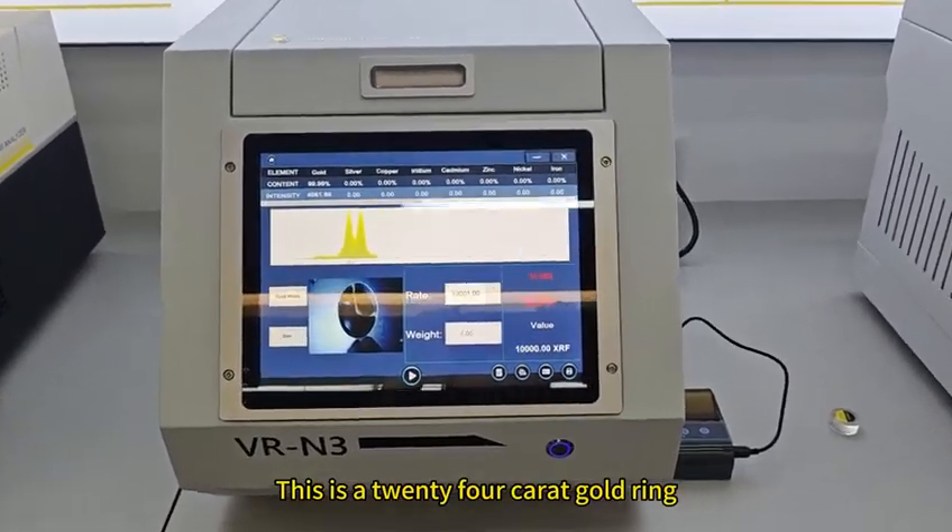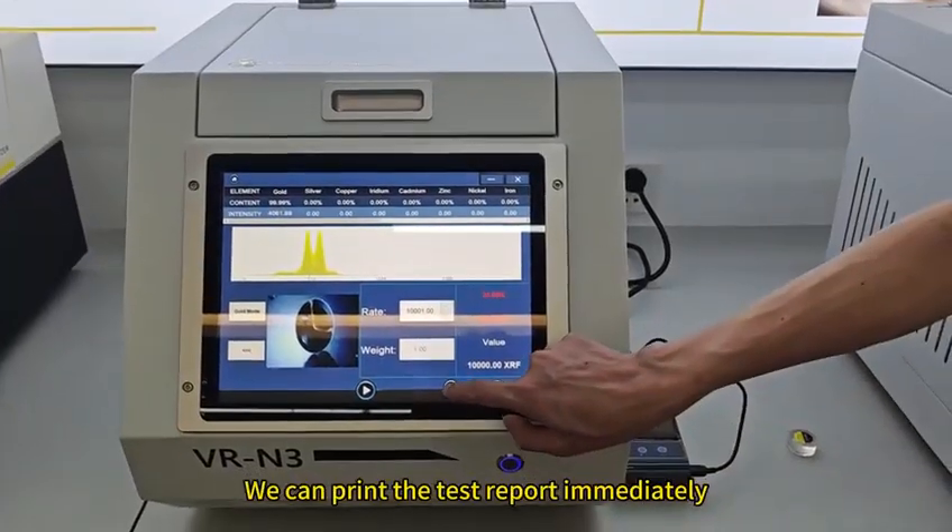This is a 24 karat gold ring. We can print the test report immediately.